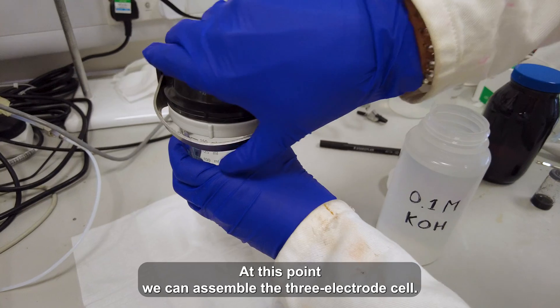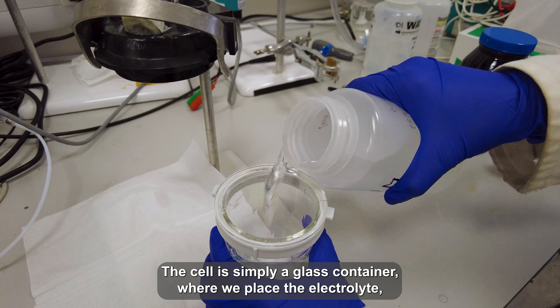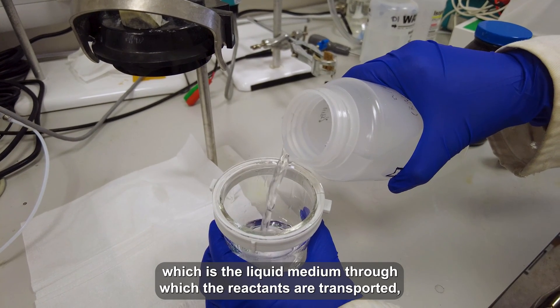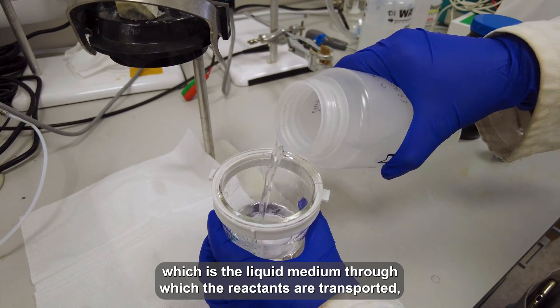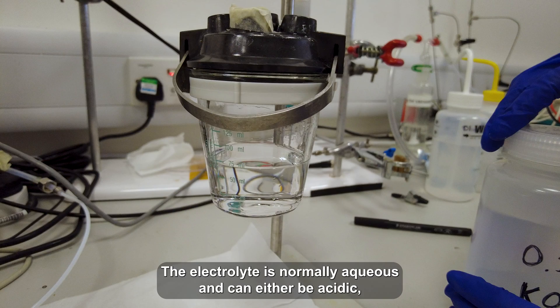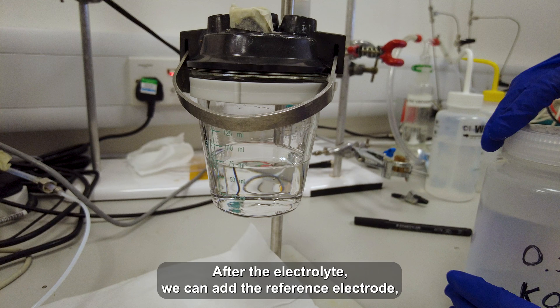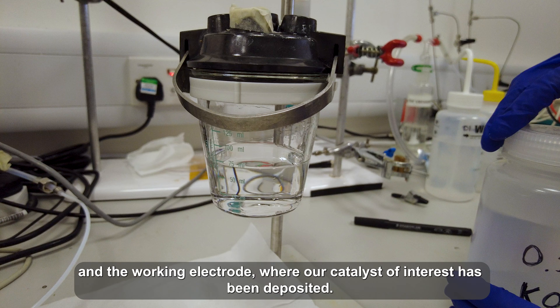At this point, we can assemble the three electrode cell. The cell is simply a glass container filled with the electrolyte, which is the liquid medium through which the reactants are transported — in this case oxygen and protons. The electrolyte is normally aqueous and can either be acidic, such as 0.1 molar sulfuric acid, or alkaline, for example 0.1 molar potassium hydroxide. After the electrolyte, we can then add the reference electrode, the counter electrode, and the working electrode, where our catalyst of interest has been deposited.